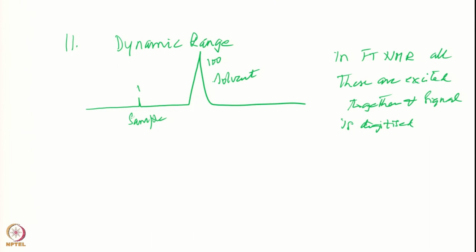So that is what I will be representing in my FID. So this is what happens in the FID. The FID has various points at various places, and in every point we will have this summation represented. Therefore, in every point the data has to be represented correctly, this sum has to be represented correctly.